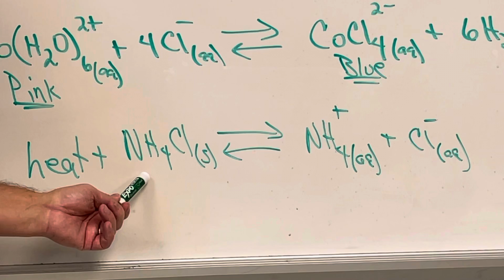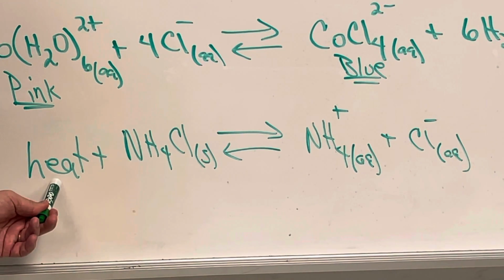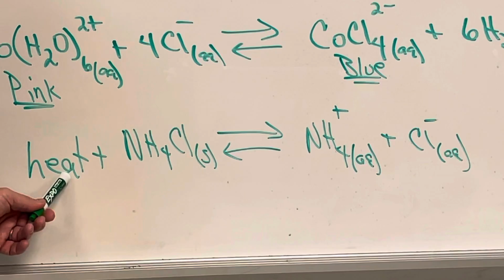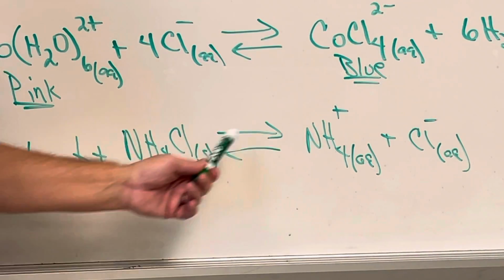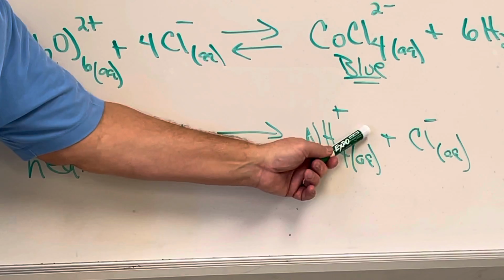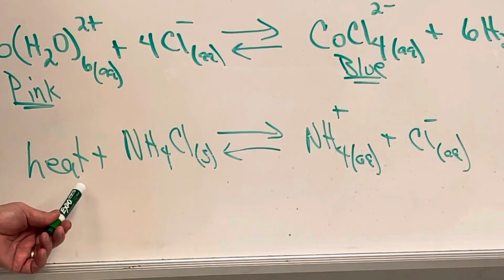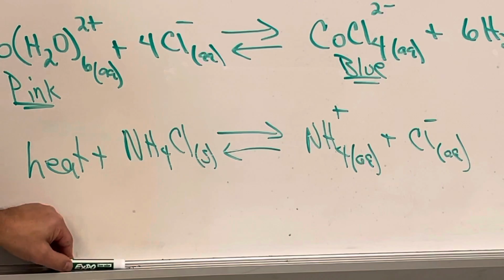It looked like it was snowing. Okay? But because the reaction is endothermic, when I put it in the heat, that drove it back to the right and caused it to redissolve again at the higher temperature. So we use temperature to cause the change in the equilibrium. So these are your 4 equilibria.